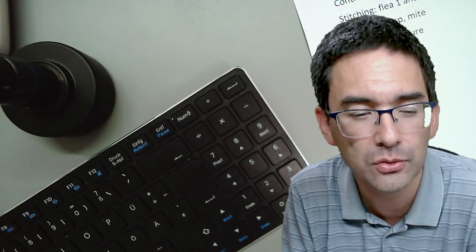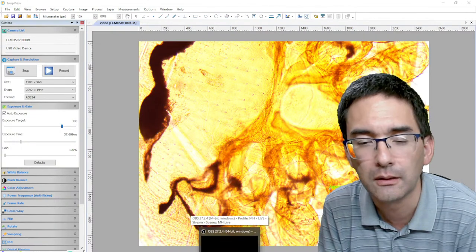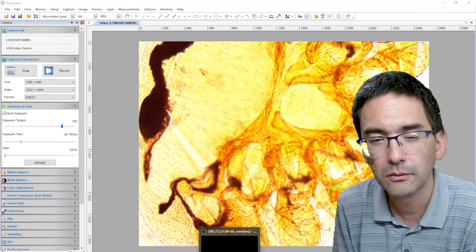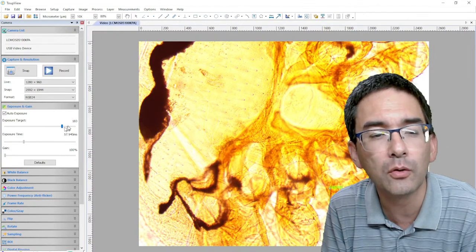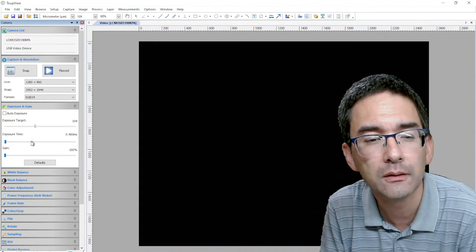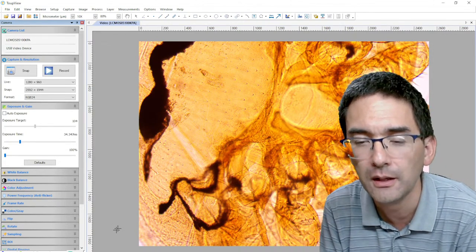Just a second. I need to go to the screen. So basically, the camera came back. Ah, good. Ta-da. It took some time and now it came back. I hope that it works. Yes, it works. I just wanted to tell you over here, because there was the question about the frame rate. You have to go down with the exposure time, and if the exposure time is too high, then of course this lowers the frame rate. Okay, good.